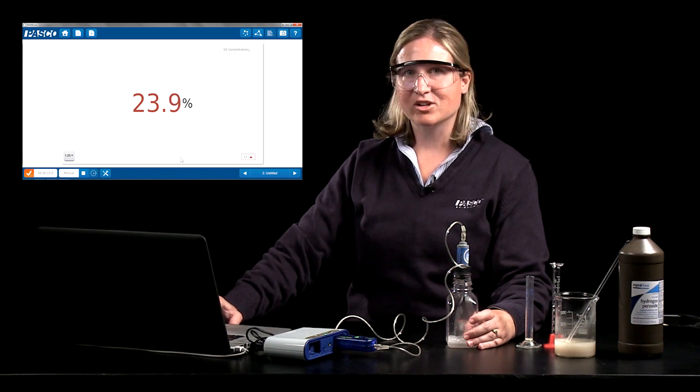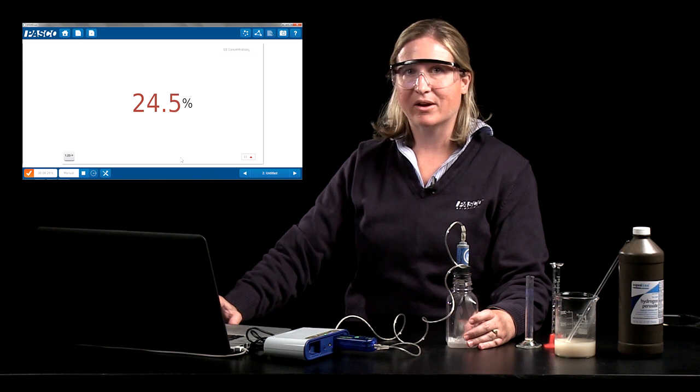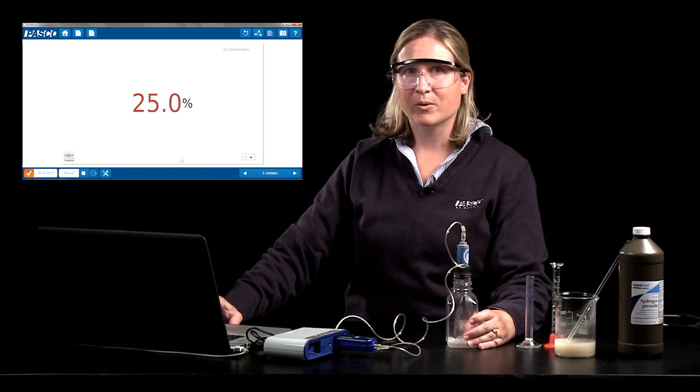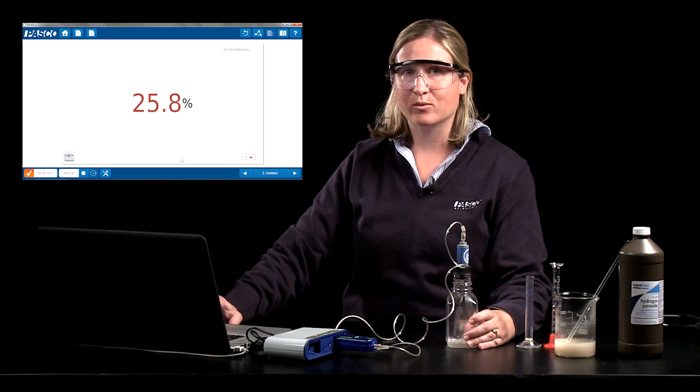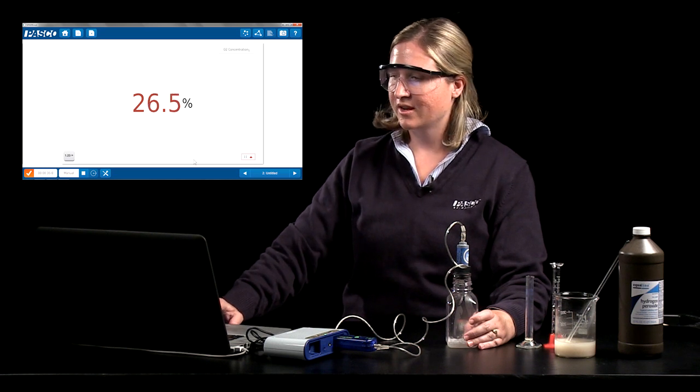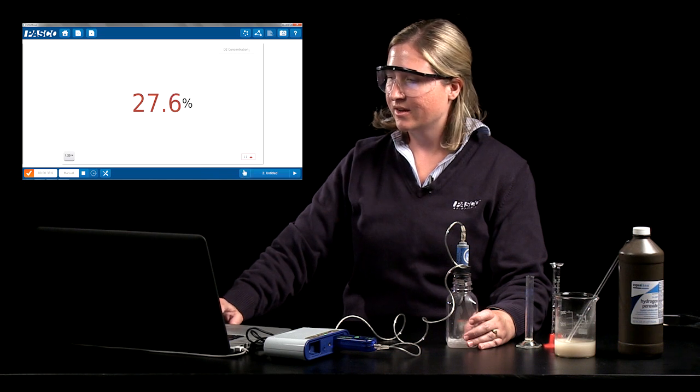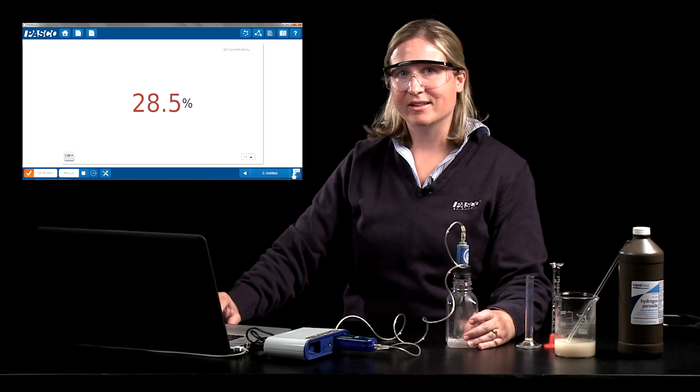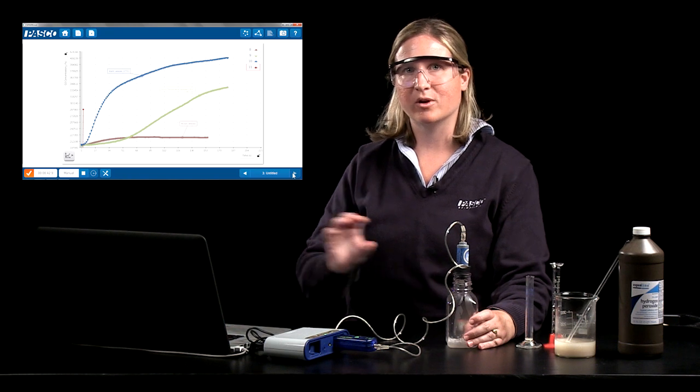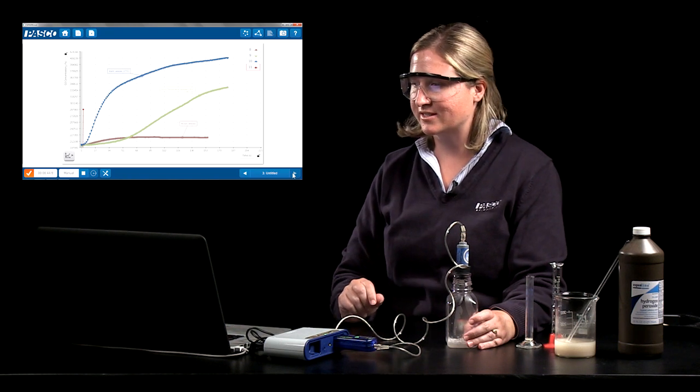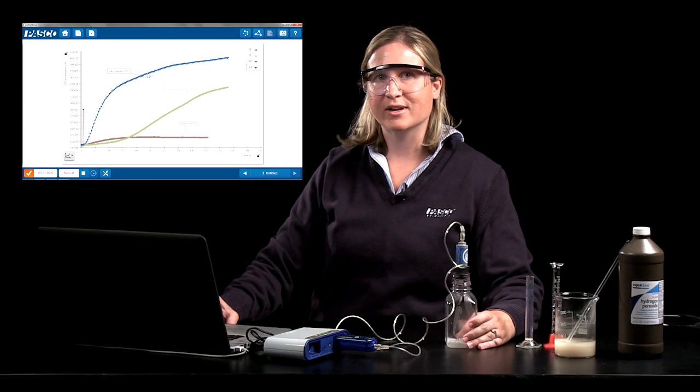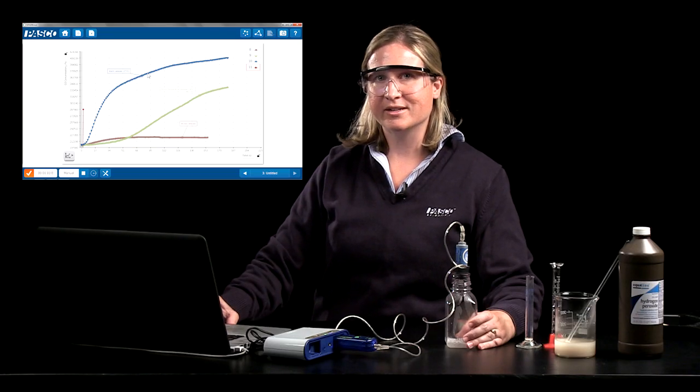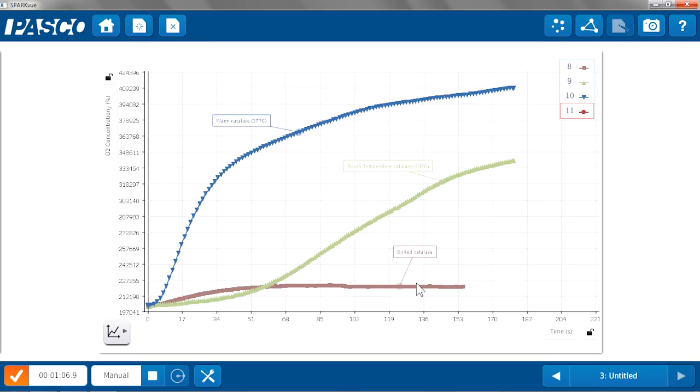So using the oxygen gas sensor students can quantify the amount of oxygen being produced but really with enzymes what we're interested in is the rate at which that oxygen is being produced used as a measure of the activity of the enzymes. So I'm going to show you some data that I collected earlier using the same method of small volumes of yeast and hydrogen peroxide in the sample bottle. And I compared room temperature catalase at about 24 degrees celsius in green here to warm catalase at 37 degrees celsius. So students can do this comparison to see how is the enzyme activity different at their body temperature compared to room temperature. There's also data here for boiled catalase so they can also get evidence of the denaturing of enzymes at extremely high temperatures.